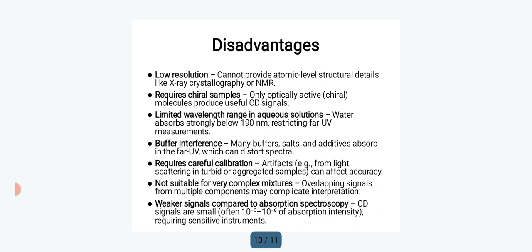Next, a limited wavelength range in aqueous solutions: water absorbs strongly below 190 nanometers, restricting UV measurements. Buffer interference: many buffers, salts or additives absorb in the UV, which can distort spectra and require careful calibration. There are also artifacts from light scattered by turbid or aggregated samples.